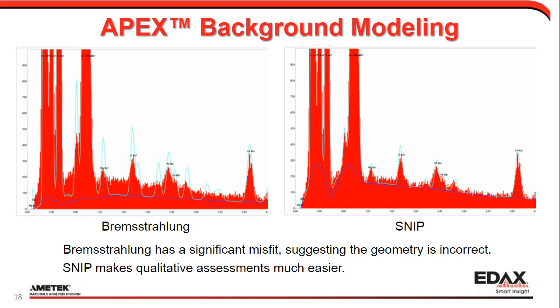There's another question about manual corrections by fitting the background. That is an option we have in the software, and again, it depends on what you're really trying to do. It can be a slight change in takeoff angle, for instance, a few degrees. Often you can see it in the background. Within the error margin, it doesn't really affect anything for the quantification routine.